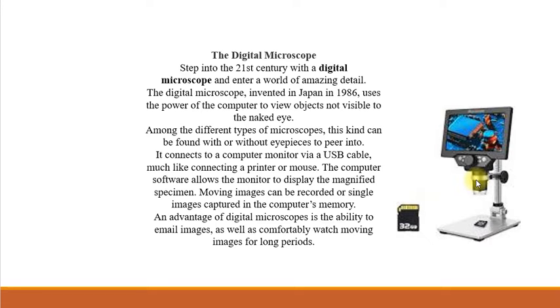The computer software allows the monitor to display the magnified specimen on this screen, and moving images can be recorded, or a single image can be captured in the computer's memory. An advantage of this digital microscope is the ability to email the images via this apparatus. Also, it is comfortable to watch moving images for long periods.